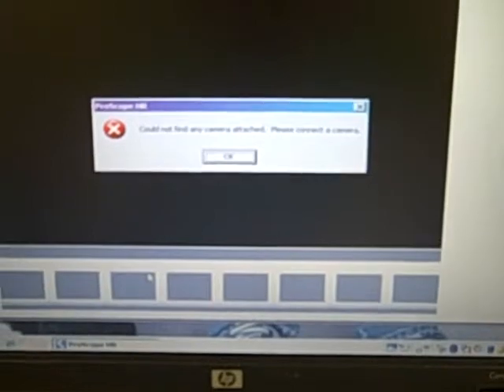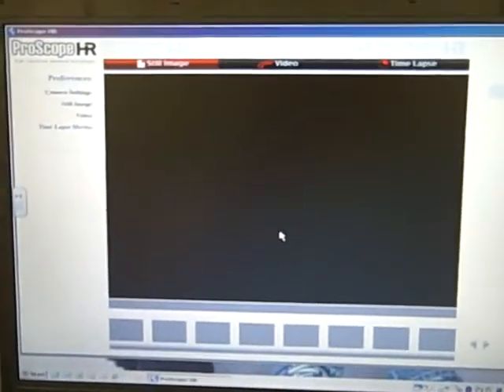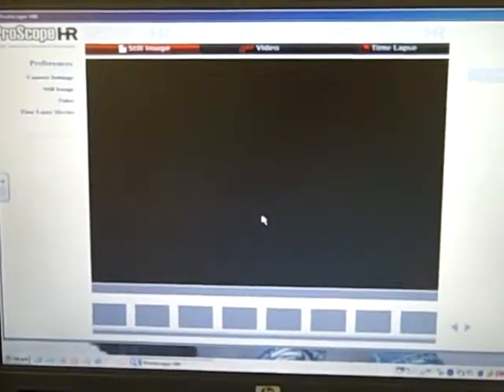So obviously there's no camera attached yet, so I'm going to click OK. And this is what the software looks like. Okay, the next thing you're going to want to do is attach that camera. I'm going to set down the flip camera here for just a second.